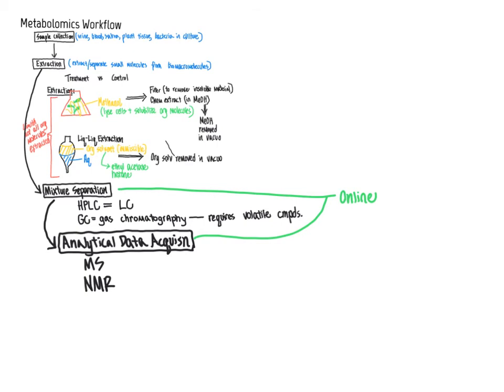So when we think of NMR as our detection method, NMR will detect any molecule that has carbons and hydrogens, and hence we could think of NMR as being really a universal detector of organic molecules.